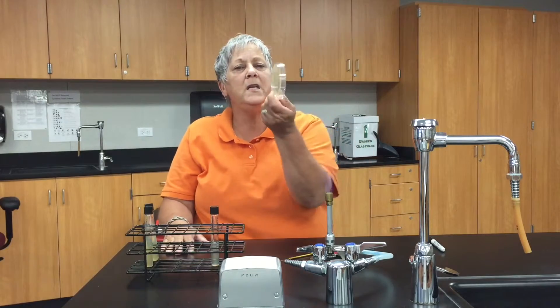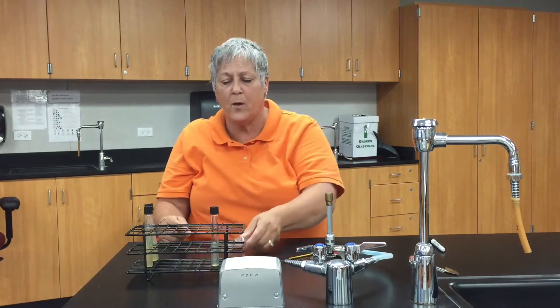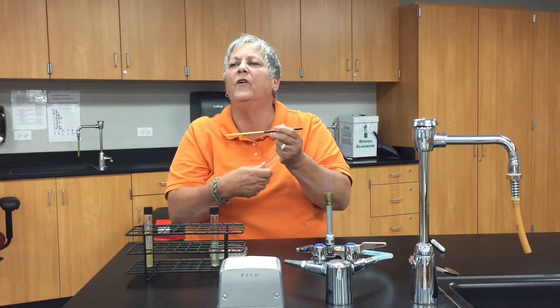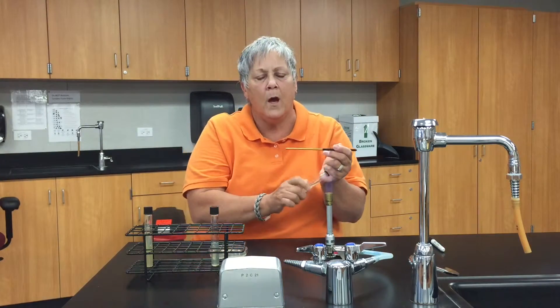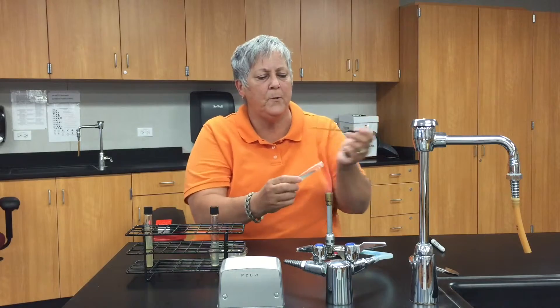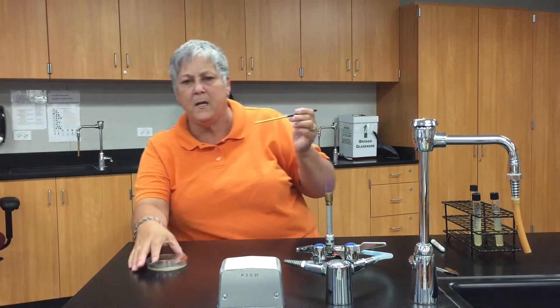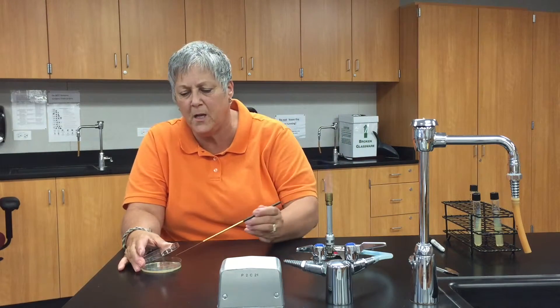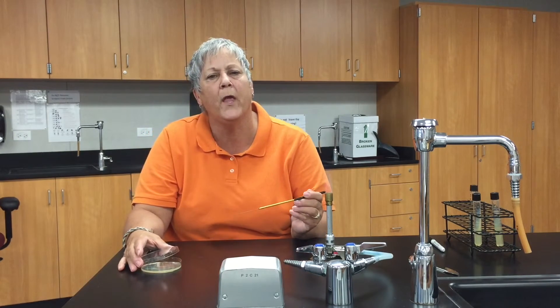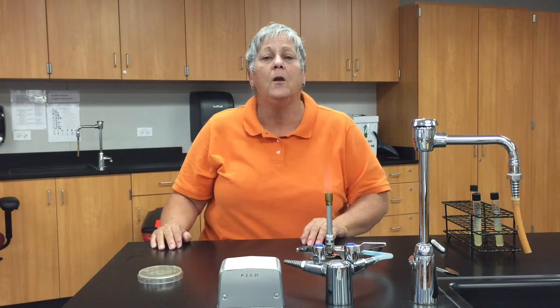Now, a swarming plate — this is a TSA plate. I would label on the bottom of the plate around the edges. I'll flame my loop, remove a little bit of the test organism from the slant. Flame the lip of the tube again, then lift the lid just enough to get in, and inoculate the organism in a circle in the center of the plate. Replace the lid, flame your loop again, and invert the plate for incubation.